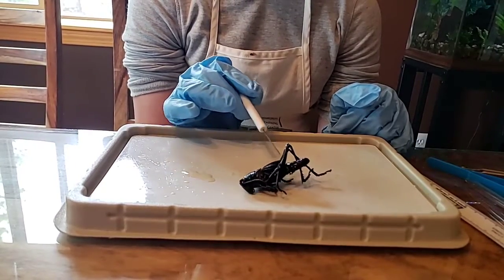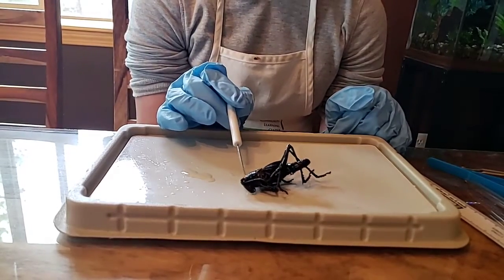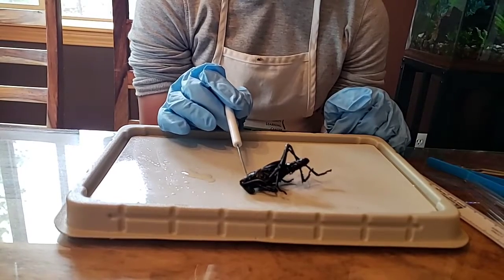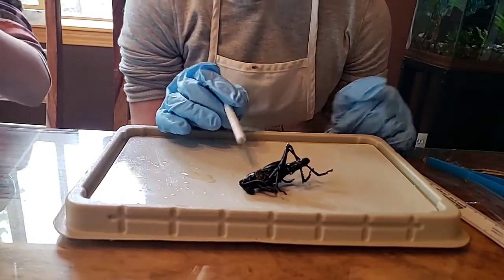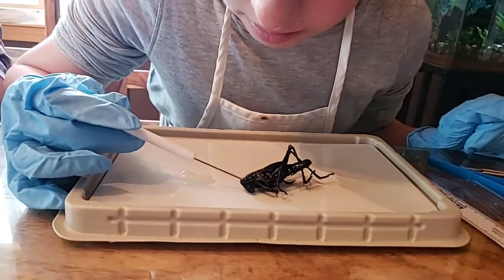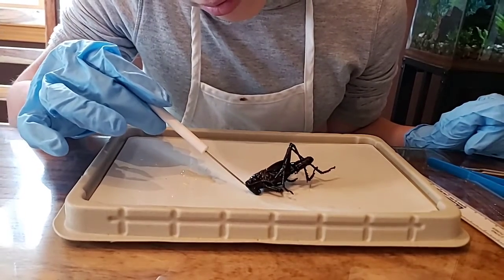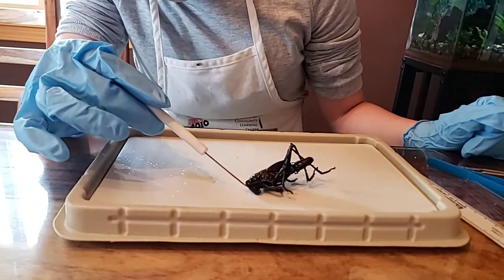All right. Number 4. The head of the grasshopper possesses sensory structures. Observe the 2 compound eyes and the 3 simple eyes located between them. So grasshoppers have a cool thing. They have 2 eyes on the side, and then they have 3 simple eyes all in the center. So like being able to walk and fly isn't cool.